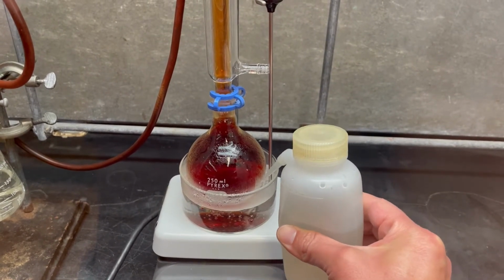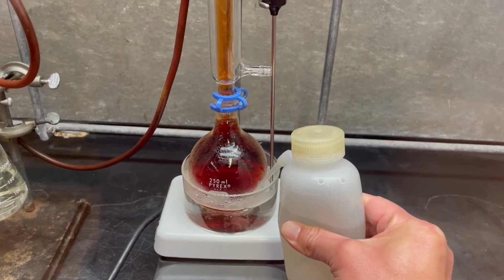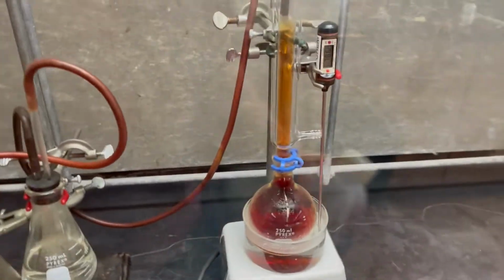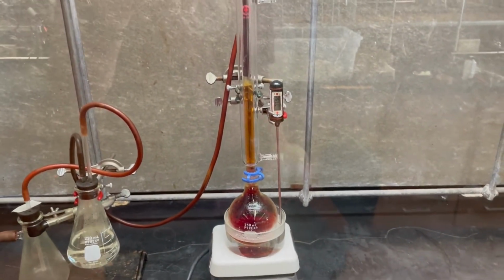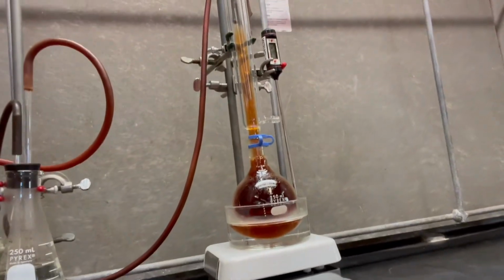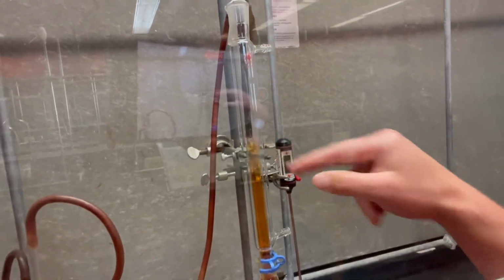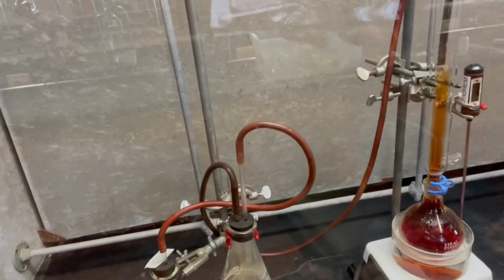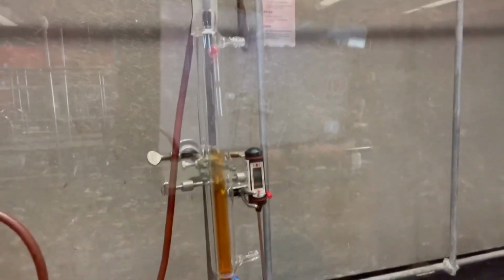Boom. Hit that with some room temp water just to cool it down. And there you go. Still moving, checking on it periodically, right? I'm about to go outside, but first, let's check our reaction. Looking good. All right, so the thing I'm looking for is, of course, right there. The gas isn't going past that hose, so it's doing its job. Good job, y'all. And it's at temperature. It's at 76, but that's cool. We're good with that.